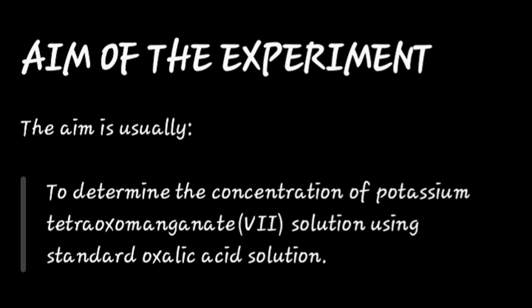The aim is to determine the concentration of potassium tetraoxomanganate 7, that's KMnO4, the concentration of KMnO4 solution, using standard oxalic acid solution. Or you determine the concentration of oxalic acid using a standard KMnO4, vice versa.